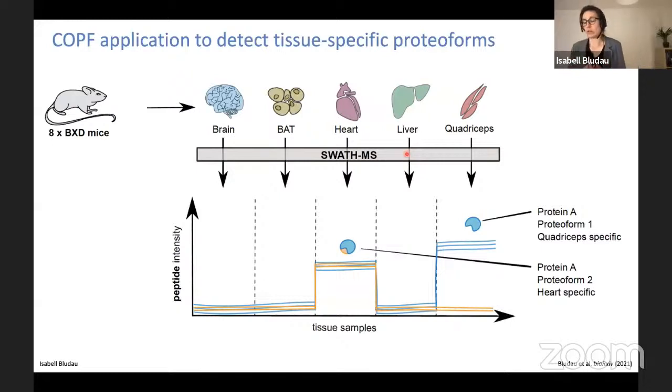And we could even calculate these stoichiometries, but unfortunately our data is maybe a little bit too sparse to get a full-blown picture of how well this works. So I would say, CC Profiler actually reports stoichiometries, but you should look at them with caution. In terms of copy numbers, I haven't done it, but in theory, it could be possible if you calibrate it right.